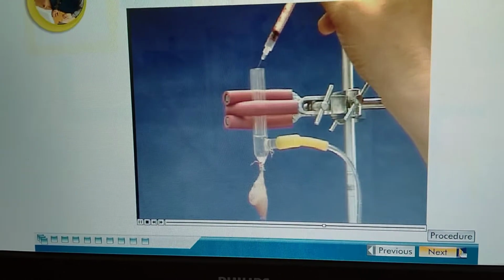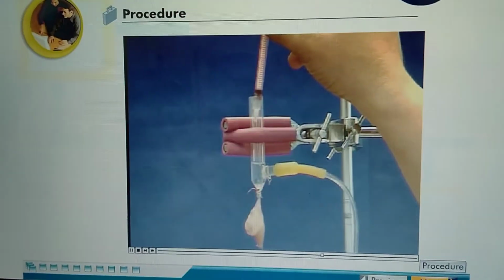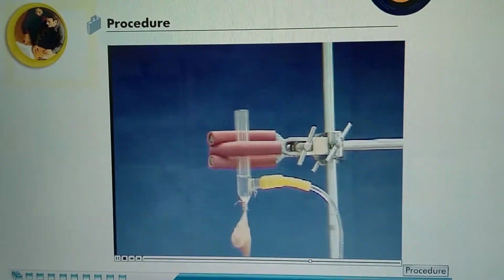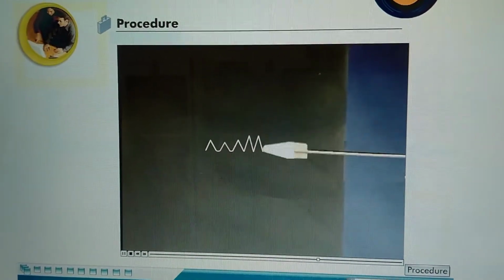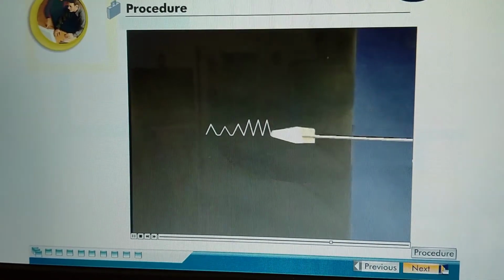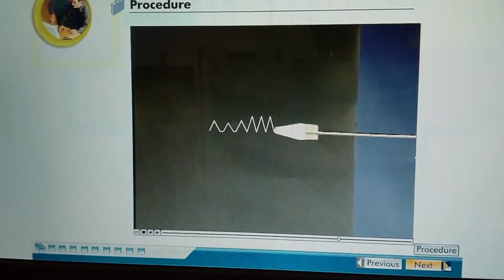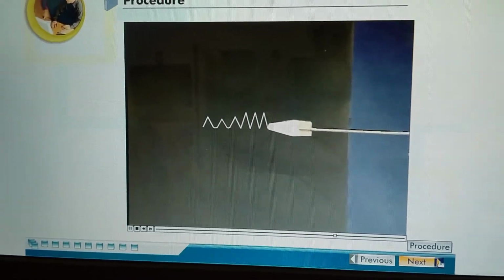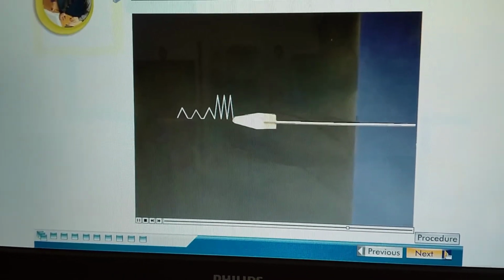Now inject 0.1 ml each of digoxin and calcium chloride solution into the cannula. You will notice that the rate and force of contraction of heart and its rhythmicity starts slowly improving, which was altered in the hypodynamic state.